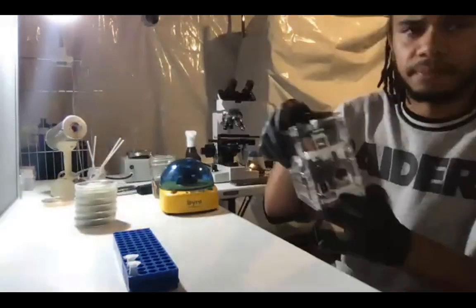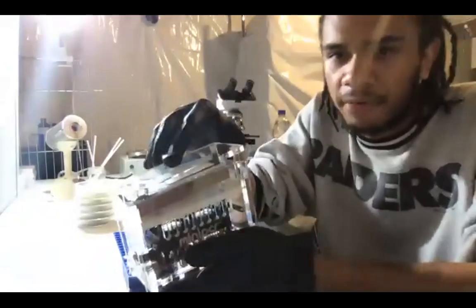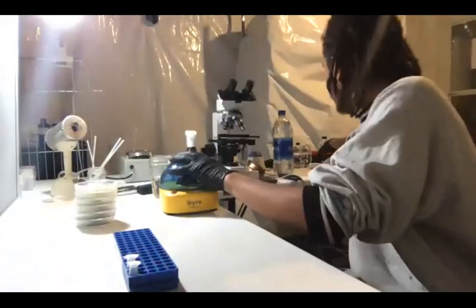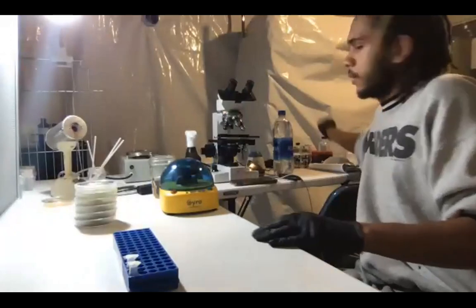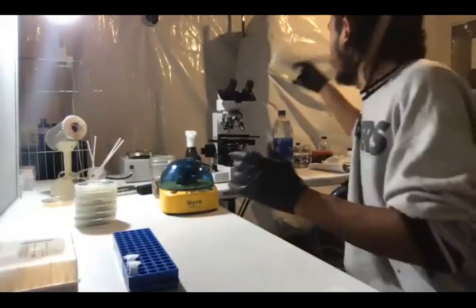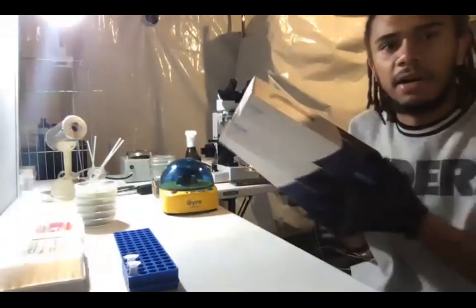So yeah, as I was saying, a lot of the equipment that I'm going to be using today comes from Mini PCR. They're a great company, very affordable. All of the equipment I got for under, I think it was like $1,000 for everything that I got. So we have the PCR, we have our centrifuge, we have our gel electrophoresis box. All of my consumables, like our pipette tips and things like that, I got from the Odin. They're a laboratory distribution company that sells used lab equipment and then new stuff for things like consumables. I have my pipettes that I got from Mini PCR as well.